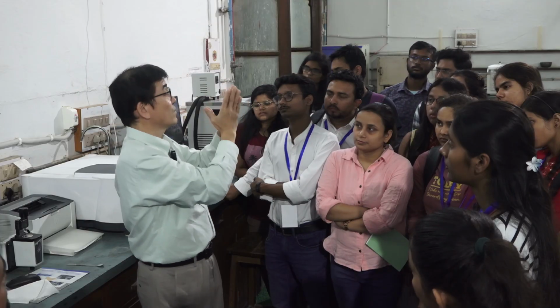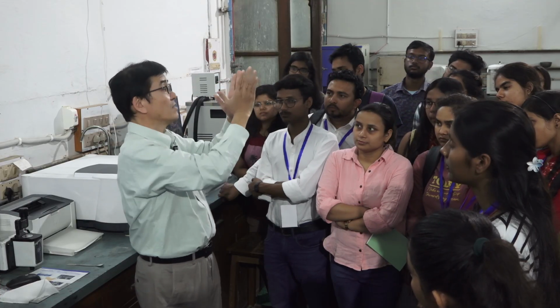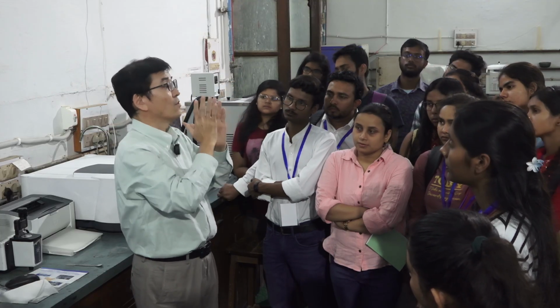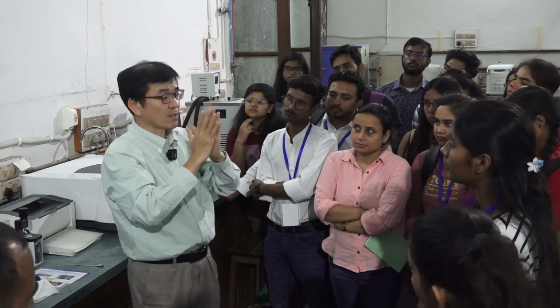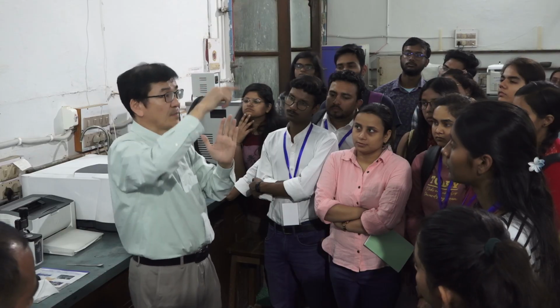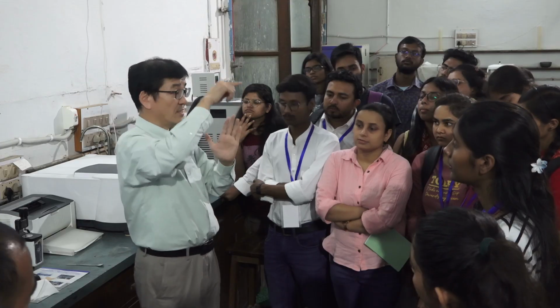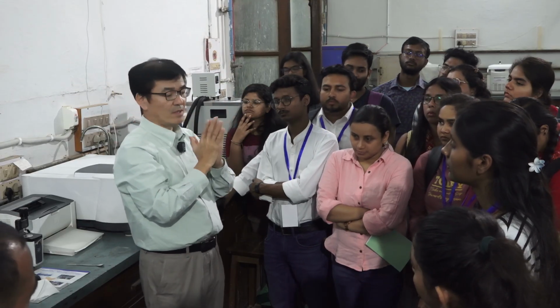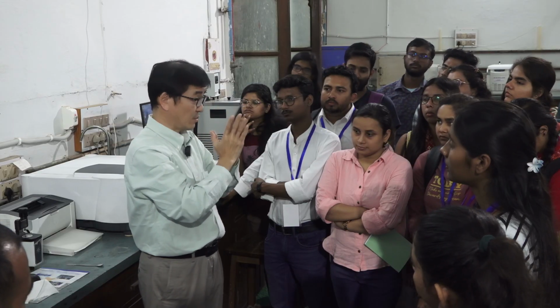If the liquid film is thick, absorption becomes large. If it is thin, absorption is small. So if this thickness is not reproducible, we cannot discuss the meaning of this intense peak. Sometimes it's weak, sometimes moderately weak. It varies, then it's very confusing. So it is a difficulty of the transmission configuration.